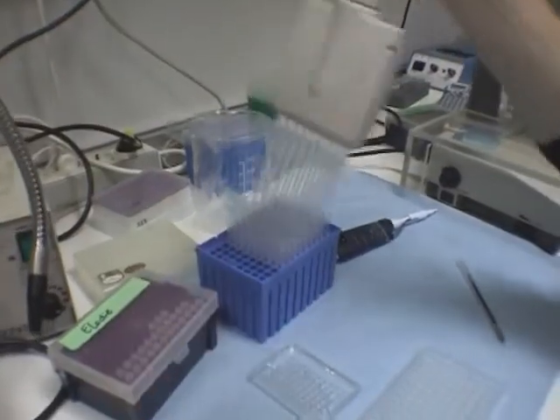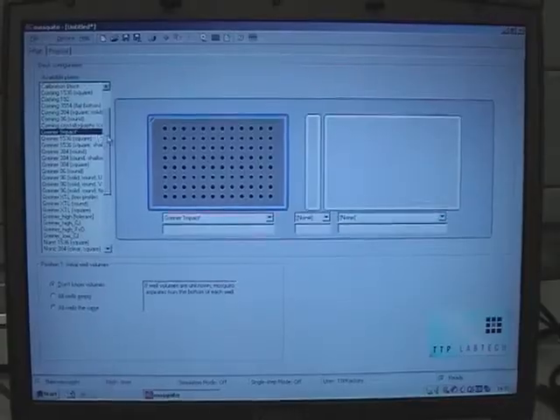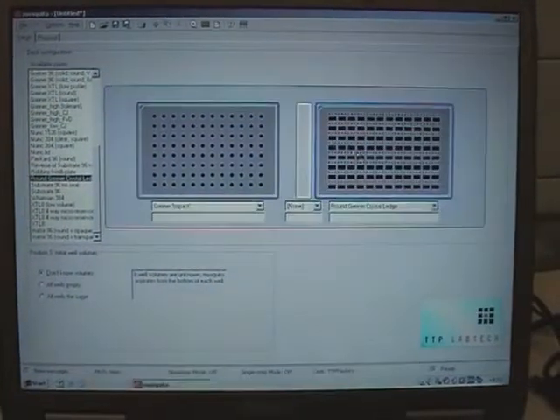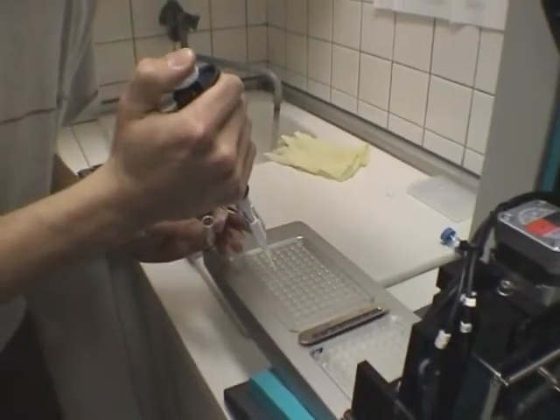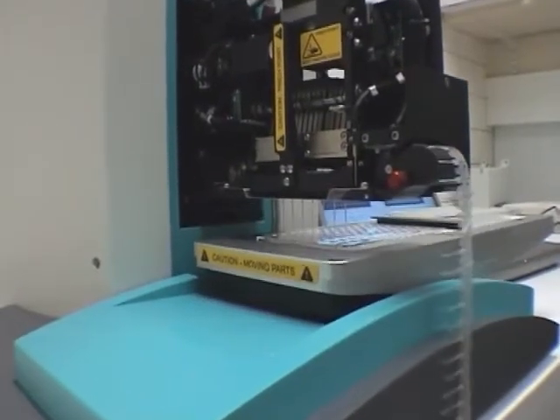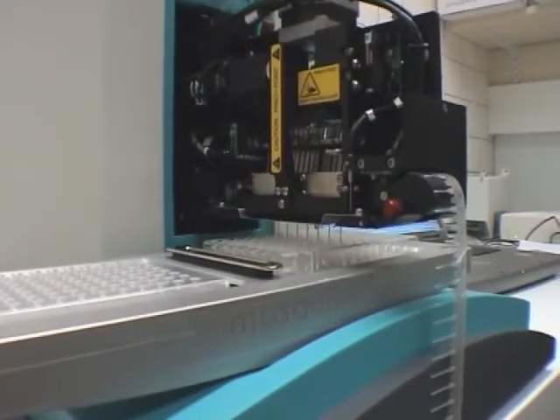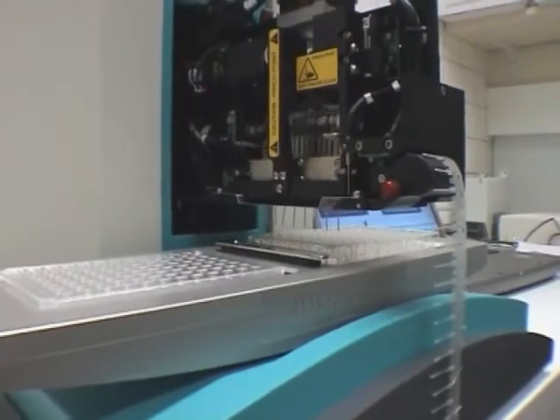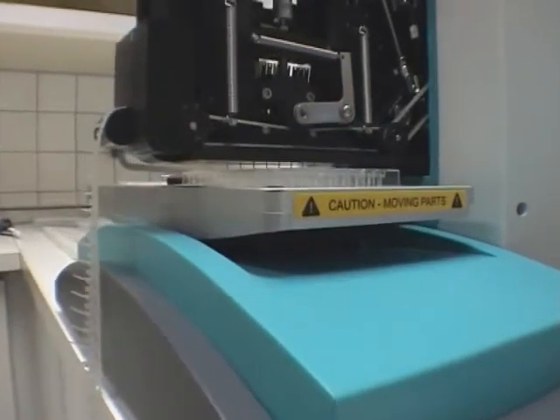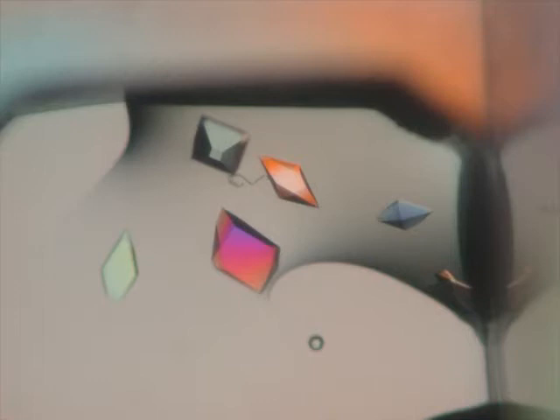The principle stays the same. Different solutions of crystallizing agents are placed in the wells of the crystallizing plate before adding the solution of molecules to be crystallized. A computer controls the mixtures produced by the robot during the preparation of the drops for crystallization. As well as allowing very small volumes to be manipulated, the robot also accelerates the preparation of the drops, thus permitting the number reached to be several hundred, if not thousands more during the initial screen.